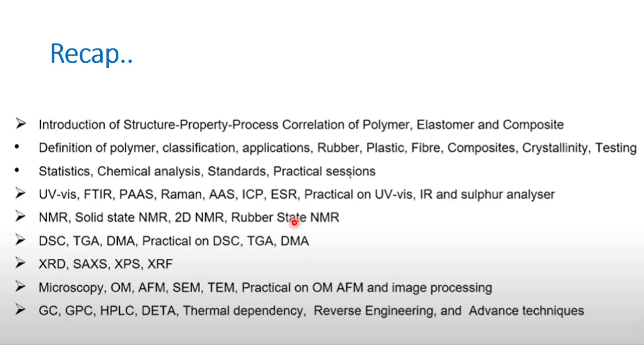We have also vividly discussed XRD, X-ray diffraction, small angle X-ray scattering, XPS, but we have not discussed that much about XRF. In microscopy, we have discussed optical microscopy, confocal microscopy, and different electron microscopy, that is SEM and TEM. We have also discussed AFM, the different modes of AFM, and how the image processing is done.